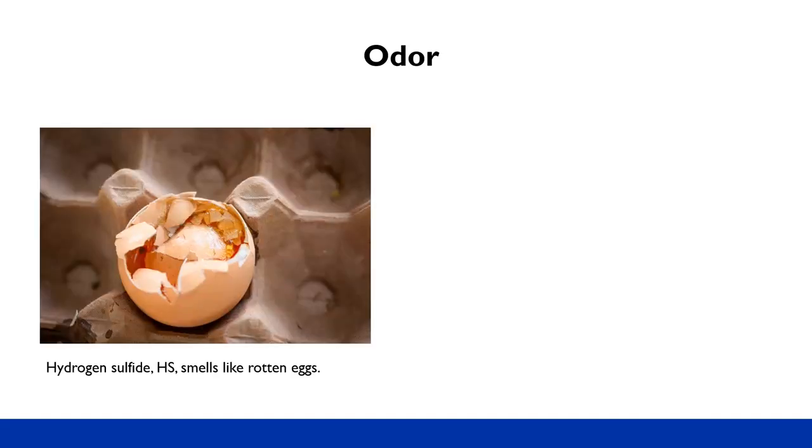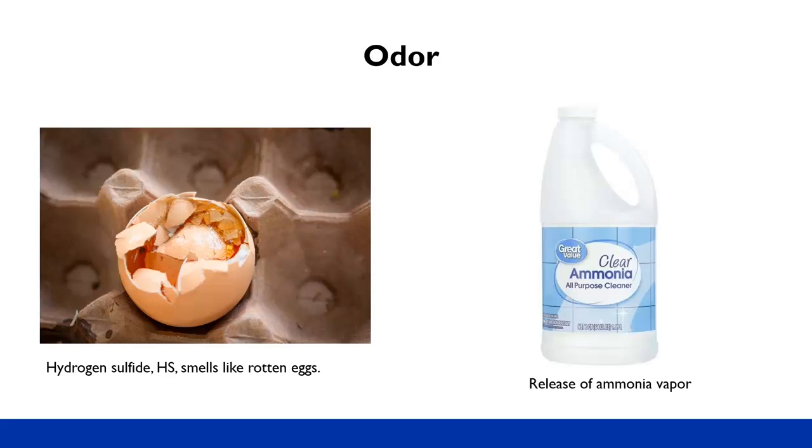You will also need to be paying attention for a change in odor. When some substances are mixed together, they can give off a variety of distinctive smells, and likely you've smelled some of them before. The change in smell is very specific. For instance, the smell of rotten eggs comes from the formation of hydrogen sulfide, H2S. This gas is very distinctive and likely you'll quickly recognize it. Another smell, that of ammonia, you've likely smelled around your home as it's a common cleaning reagent. If you smell that, you know you formed ammonia gas.